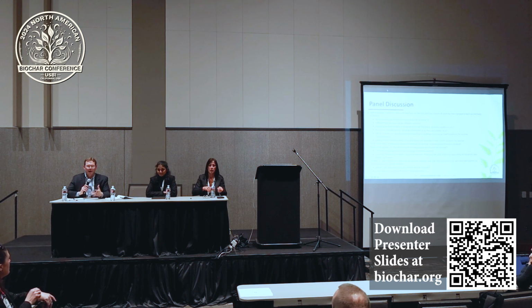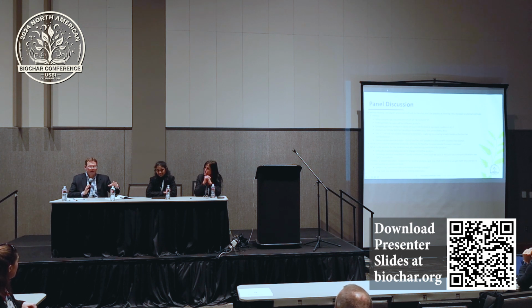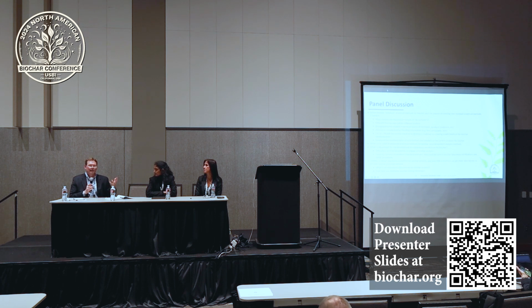I have no clue what IBI might do, but I know what tends to happen in standardization. You create a standard, and then more standards, and then you subdivide those into categories and create more standards for the subcategories, and it just gets bigger. I think in time, as the standards develop, they'll become more robust, more specific and more dedicated to specific applications. Instead of one analysis of all parameters being good for all, it'll become smaller suites of standards, more pointed to the purpose.